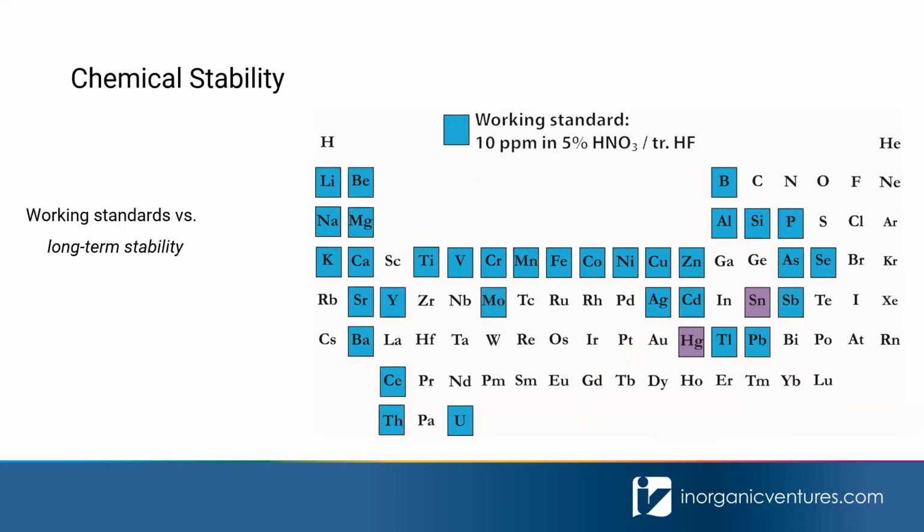What about the chemical stability and talking about working standards? One of the things that we want to focus on is the difference between a working standard that you need to be stable for perhaps days or weeks versus long-term stability. We focus on solutions that will be stable indefinitely, but it is perfectly acceptable for you to prepare working standards in your lab that might only be stable for a day or two, as long as you understand that. Then you can use those very quickly and get fantastic results.